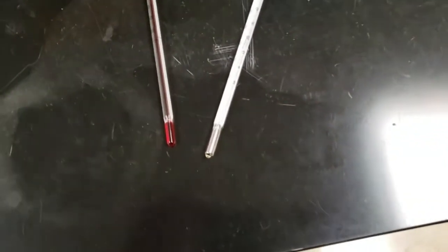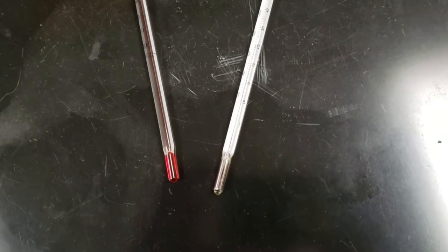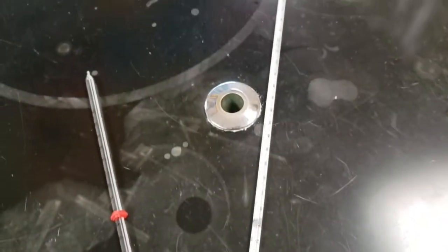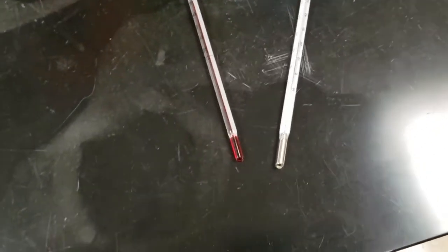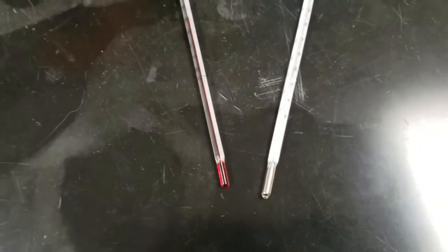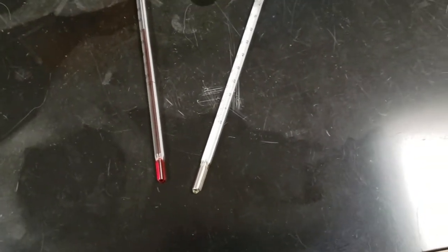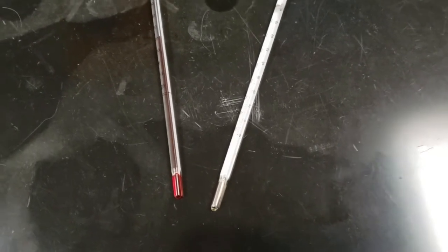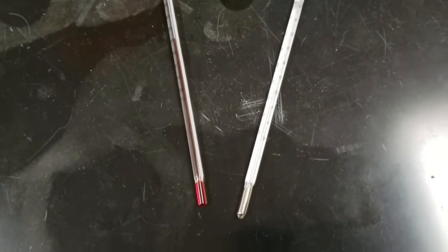Here are two thermometers. One of them has mercury in it, and one of them is a spirit one. The one on the right is mercury, and mercury is a very dangerous element. It doesn't go away. It will evaporate, and so we don't really like using these, even though they're really good thermometers. The one on the left, if you happen to break it, you just sweep up the glass and throw it into the glass dispenser.